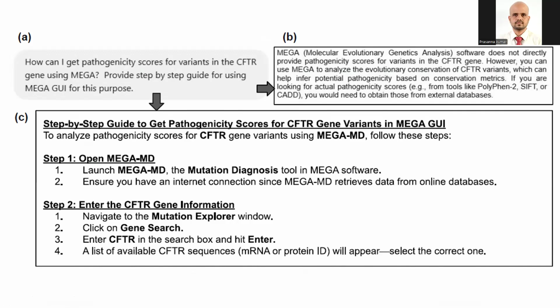I firmly believe that by now you know how to prepare your input file, how to do a multiple sequence alignment, how to import that into MEGA, and how to carry out multiple sequence alignment if necessary, and also phylogenetic analysis. Most of you have constructed a high quality phylogram, and congratulations for that. I'm very confident that by now you can handle biological data through ClustalX and MEGA. So today we will see how to test this prompt given by MEGA-GPT in the MEGA software tool.